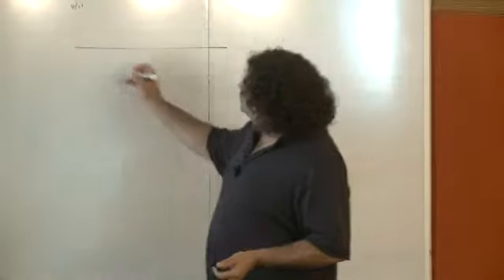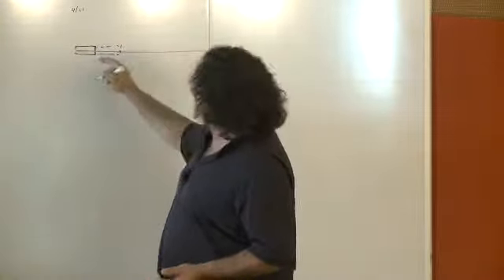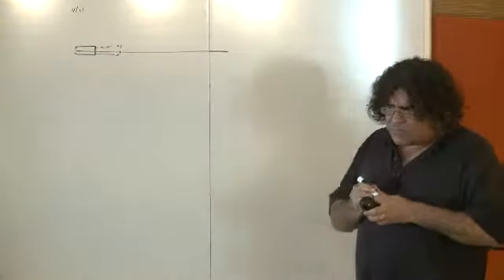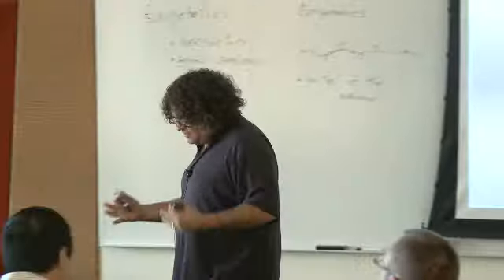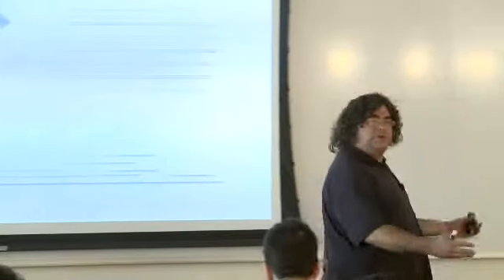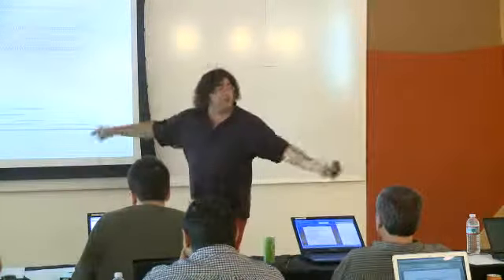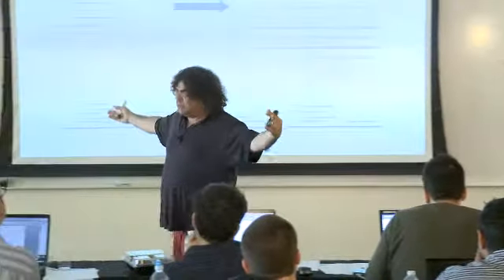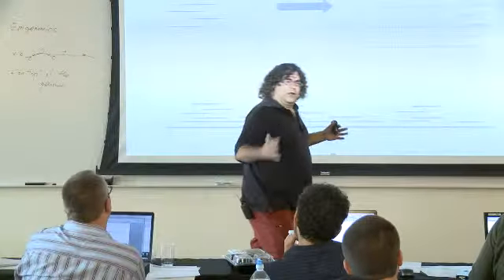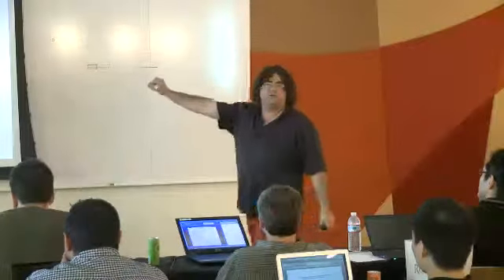When you sequence it, you have a choice. In the Illumina, you prepare the library and decide how you run the machine. You can read the sequences from just one side or from both sides, and you can read this far or more. You have these choices. That was common at the beginning of sequencing applications, and it's still being done. If you want to sequence some new organism, de novo, you don't know what you're doing, you're trying to get large chunks as much as you can. That makes putting back the puzzle a lot easier. So if you can do 300, 400 base pairs, if you can do paired end, assembling the original genome is much, much easier. But for a lot of the something-seq technologies, all you really want in the end is enough sequence to be able to map things back to where they are in the reference genome.